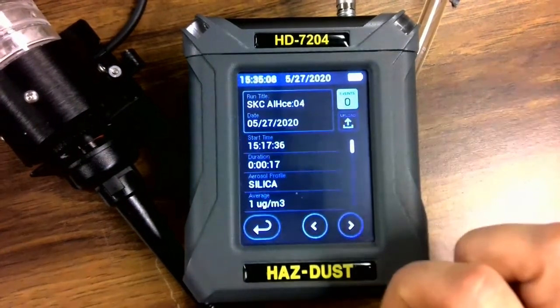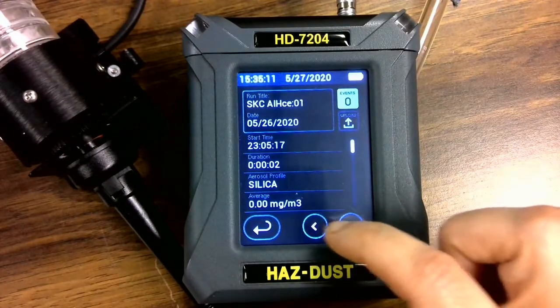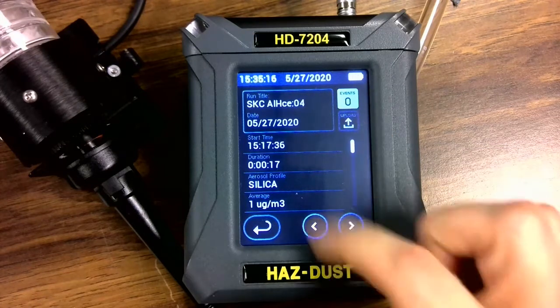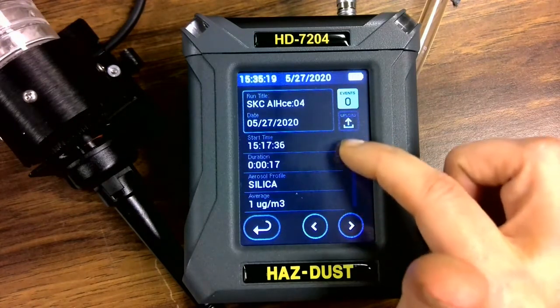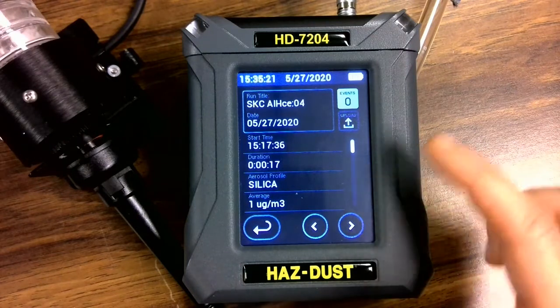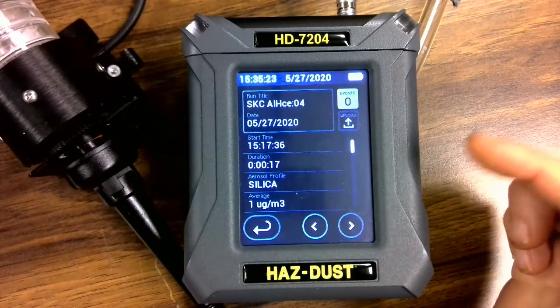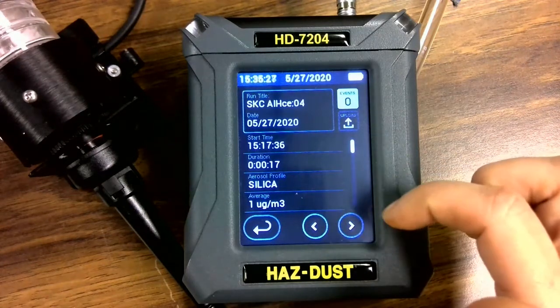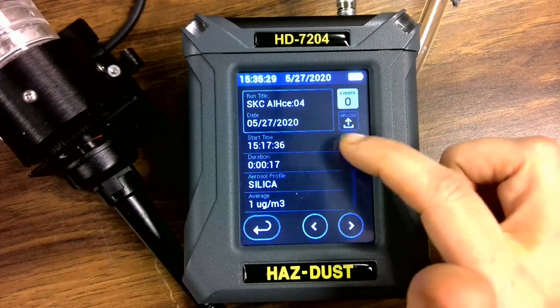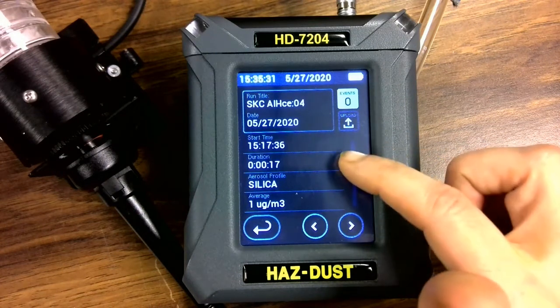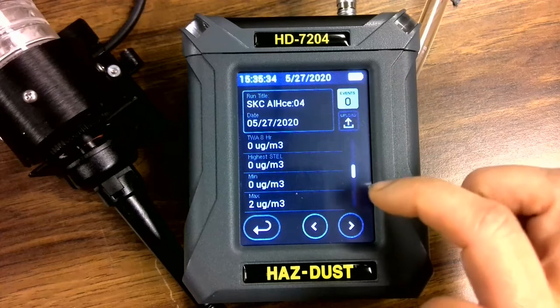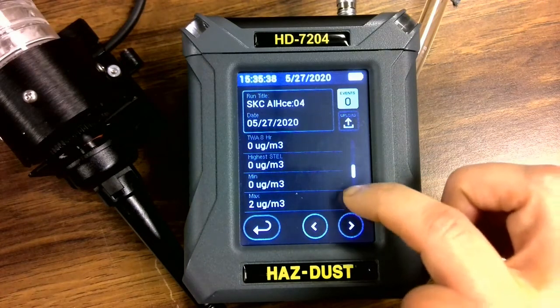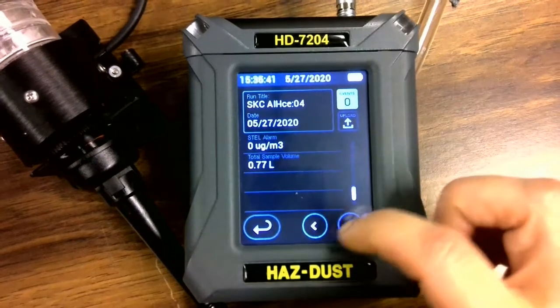The middle button will show your numerous data sets. In this case, we had four data sets under that title. We can scroll through and look at the on-screen statistics — your start time, your duration, aerosol profile (in this case I named the aerosol silica), the average, the time-weighted 8-hour average, STEL, min, max, and total sample volume.